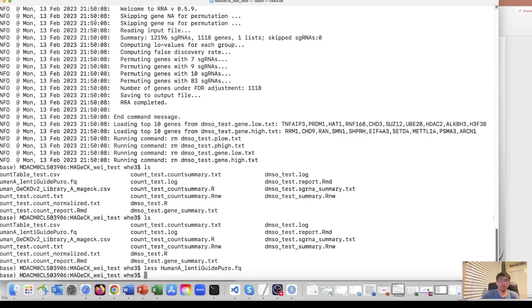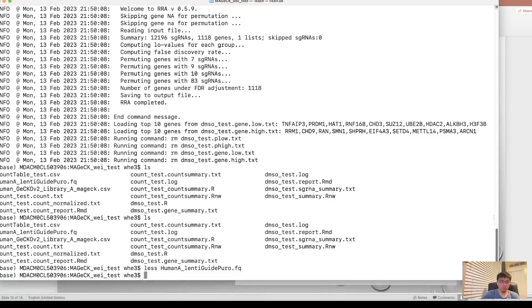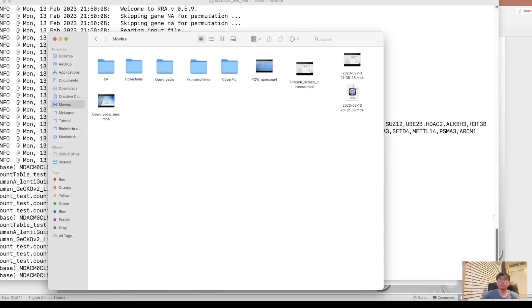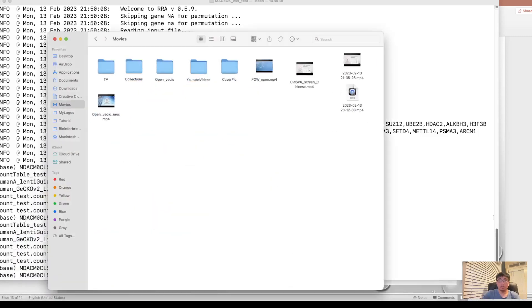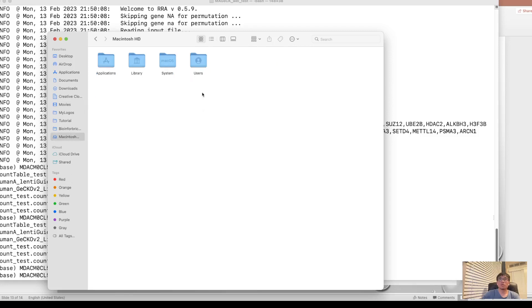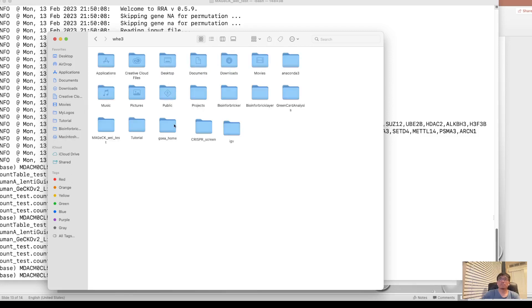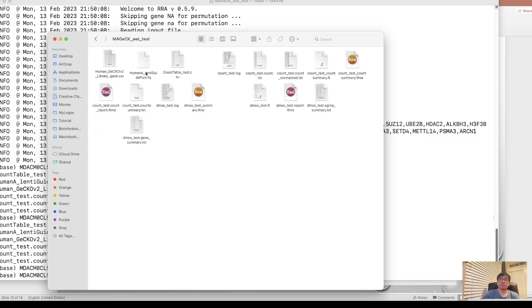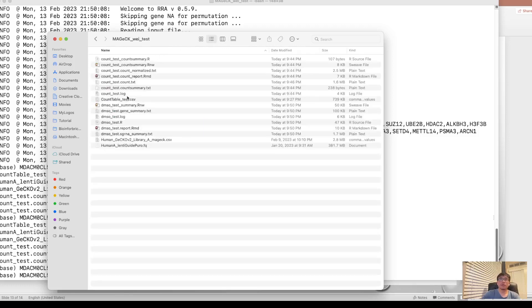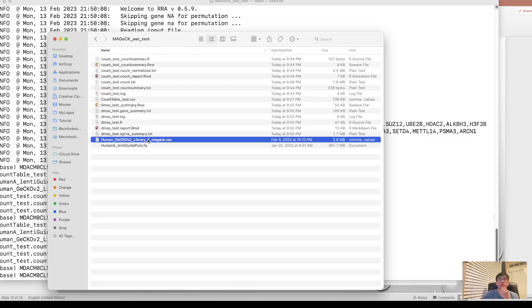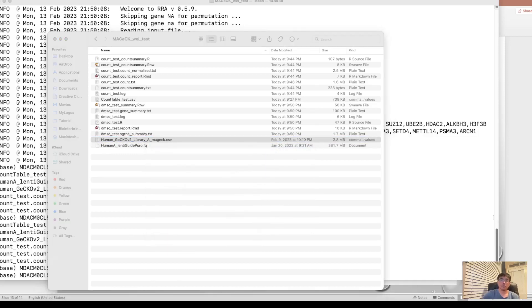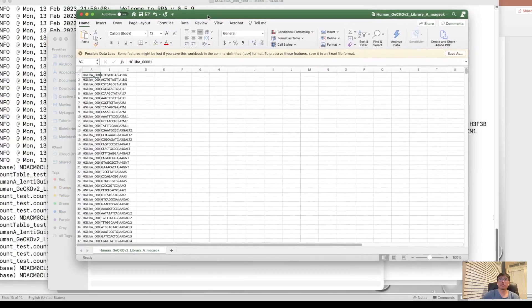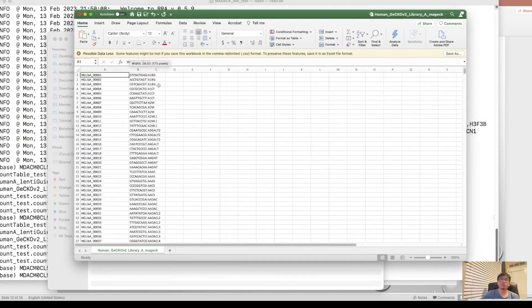And another file we need is the library file. So here I have the GeCKO library. So I will show you what it looks like. Let's go into this MAGeCK test. So this is the library. Let's open it.